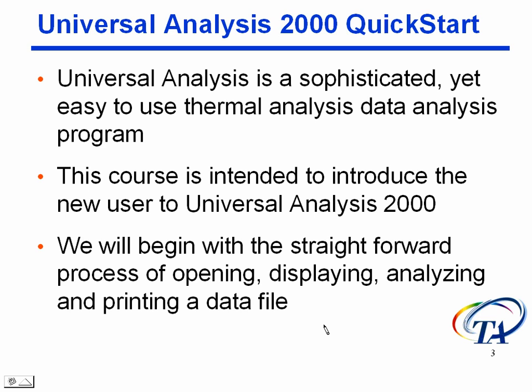There's a wide range of analysis functions. But yet, it's actually easy to use because there's a series of default settings that will be suitable for probably the majority of users, okay? And it's perfectly safe to start out with those and not worry about everything else. And then as you get more used to the program, you can start branching out and looking into all these various options that you have.